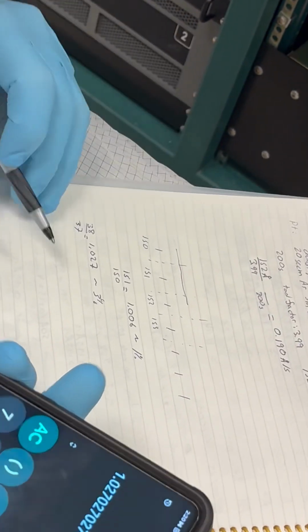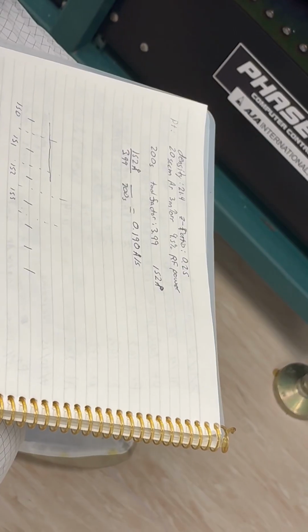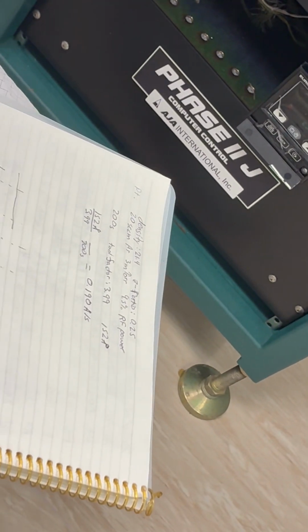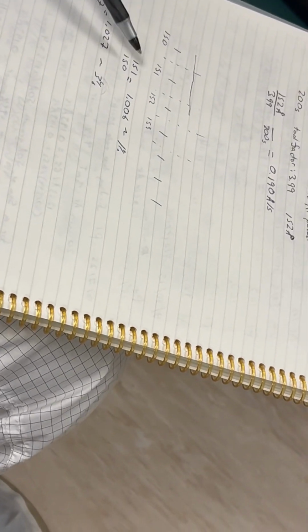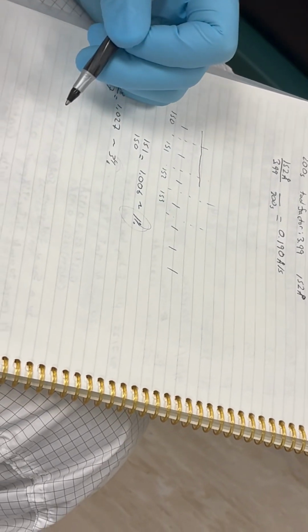Right? Now it's actually 3.99, the difference from this number to this number. So we're taking the error we could get just because it can't tell us the difference between 37.49, which is going to be 37, and 37.51, which is going to be 38. Just because it's got that accuracy, it doesn't have an extra digit it can place here. It's going to have an error of 3%, just because it can't tell us. Versus if we add that fake tooling factor, it's going to give us more digits because it's going to tell us a number that's 3.99 times as big. We've dropped that error down to 1%. Does that make sense?